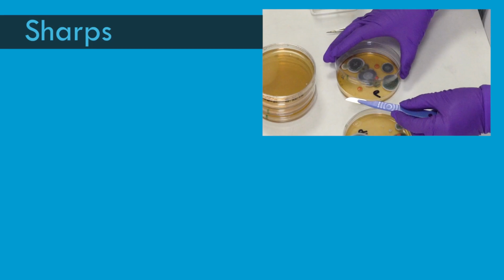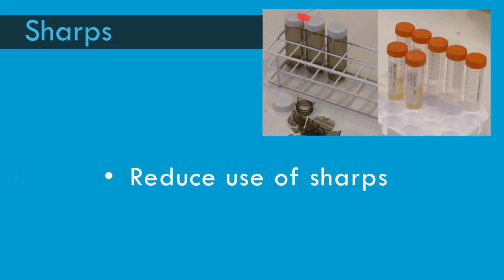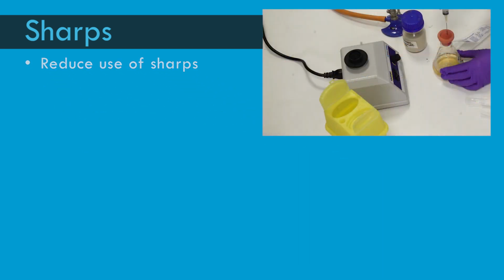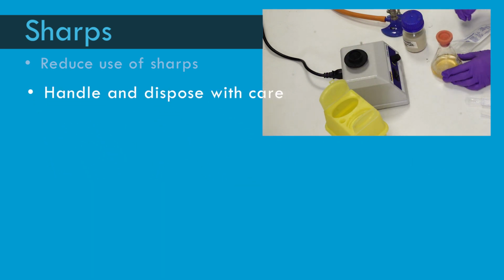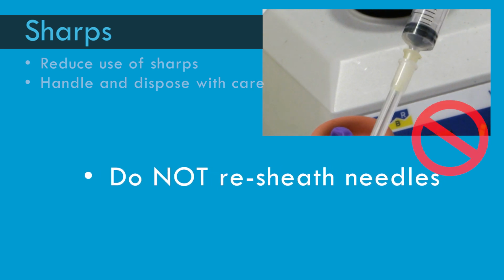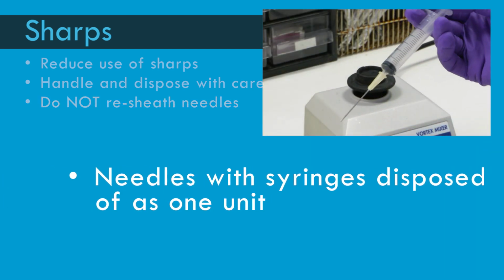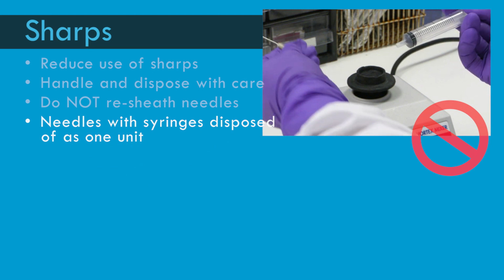In summary, good practice for working with sharps includes: reduce the use of sharps where possible, handle and dispose of with care. Do not resheath needles, as this is a key route of transmission for laboratory-associated infections. Needles must not be removed from syringes. Instead, they should be disposed of as one unit.